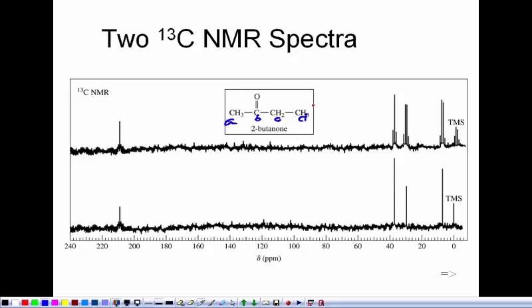So this peak turns out to be our carbonyl because it's just a single peak and it has the right chemical shift for a carbonyl. If you look at some of the other ones, the last 3, what we've got is a triplet and 2 quartets in that top spectrum. One rule says that if you've got a triplet, that means you have a CH2. If you've got a quartet, it means you've got a CH3. So the power of carbon NMR is that it gives you the pieces.